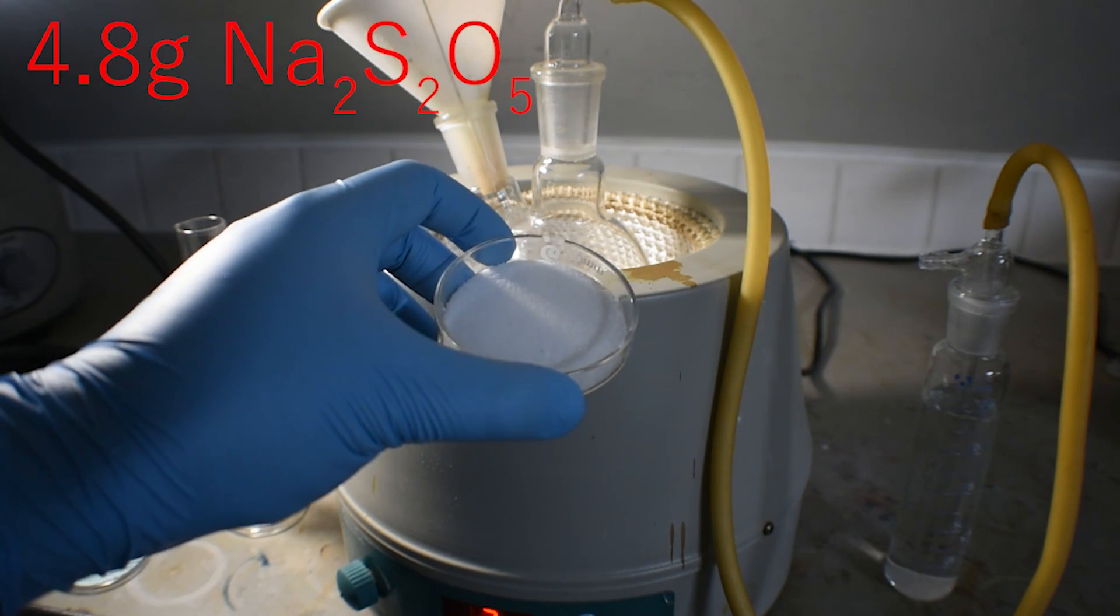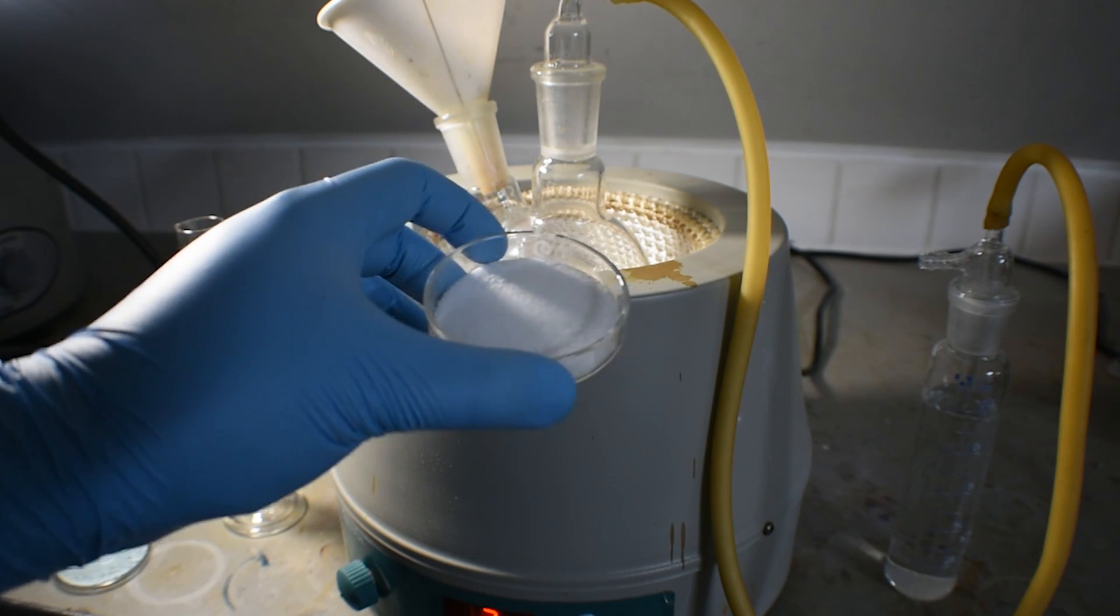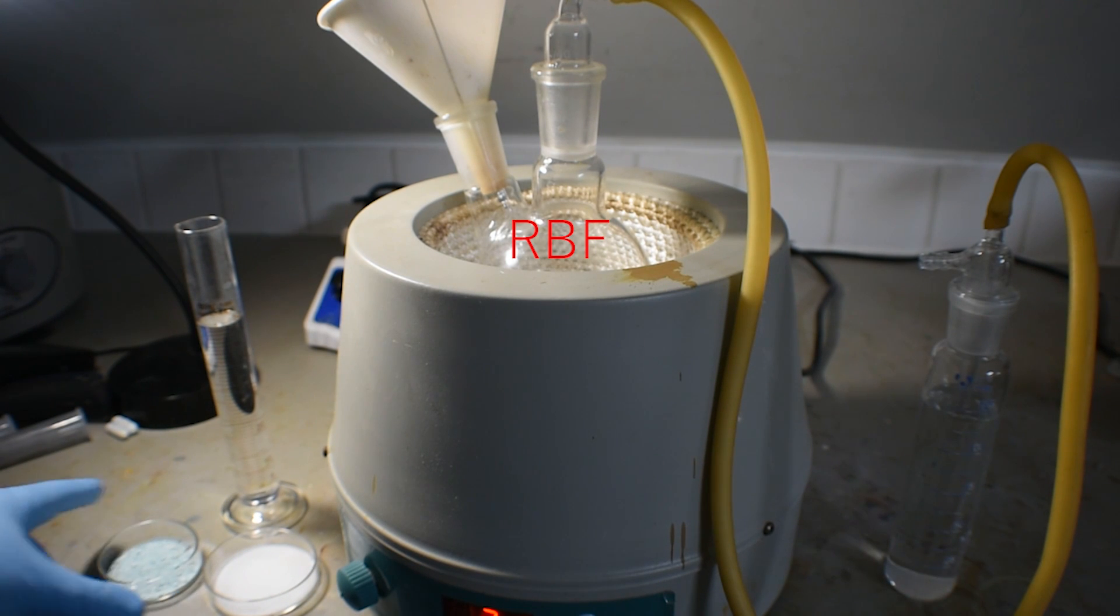which I'm going to combine in a 250ml two-necked round-bottom flask, which has one arm stoppered, while the other arm is occupied by a gas takeoff adapter, leading to a wash bottle filled with about 10% hydrogen peroxide. This serves to scrub out any sulfur dioxide which is produced in the reaction.